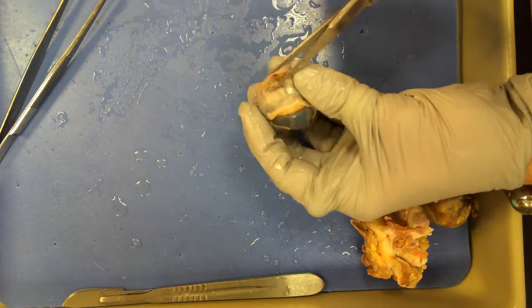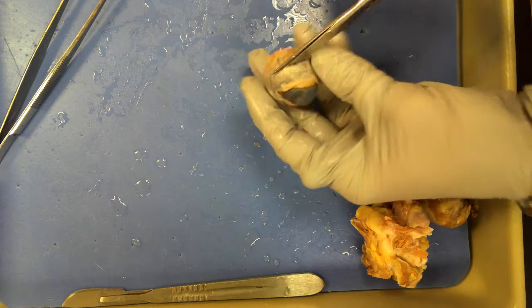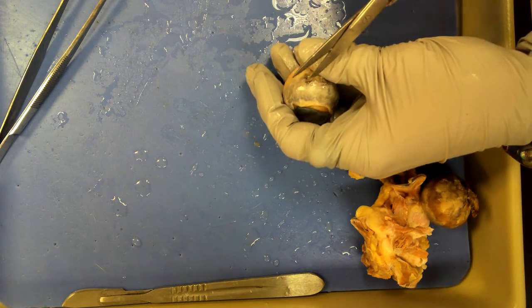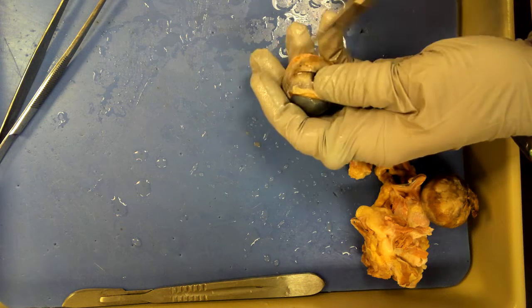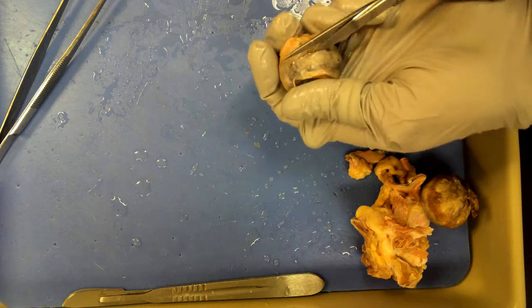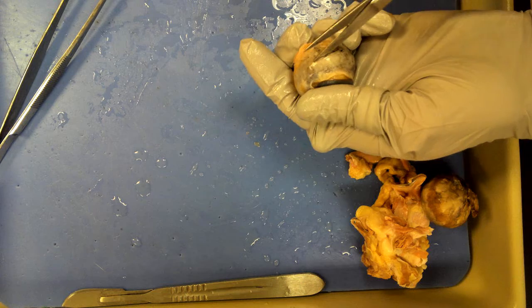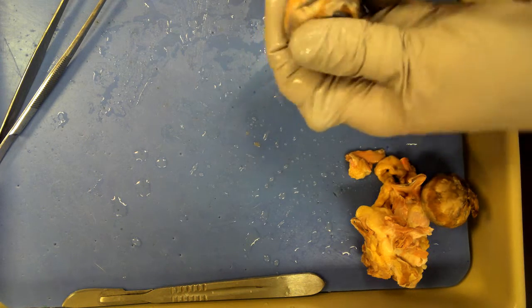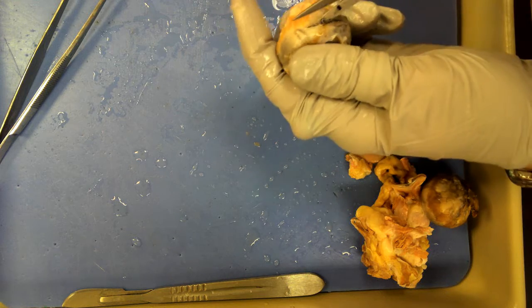Now I'm just going to be cutting around. If you see any liquid leaking out, it's probably either preservative or a mixture of the preservative fluid and the aqueous humor. The reason there are black flakes is because of all the black pigment in the eye.